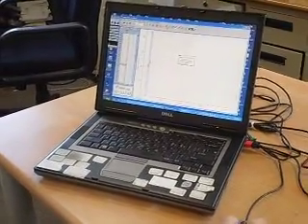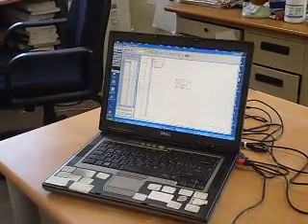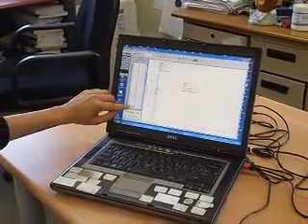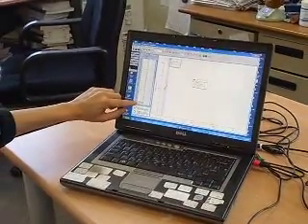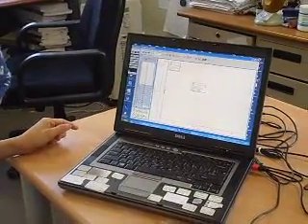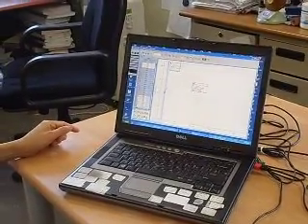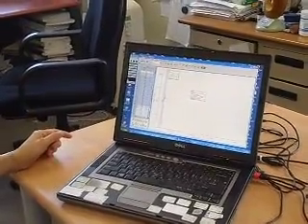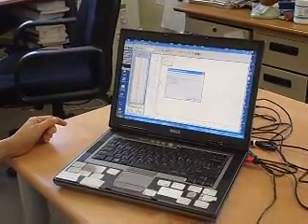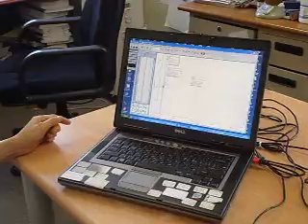So what I'm going to do is click on here, look for 38. So I got 38 now, and I'm going to get the first 20 seconds. 38 plus 20 will give me 58. So I'm going to highlight till 58. Next, get into best fit, my second run. Click on OK. This will give me my second run.